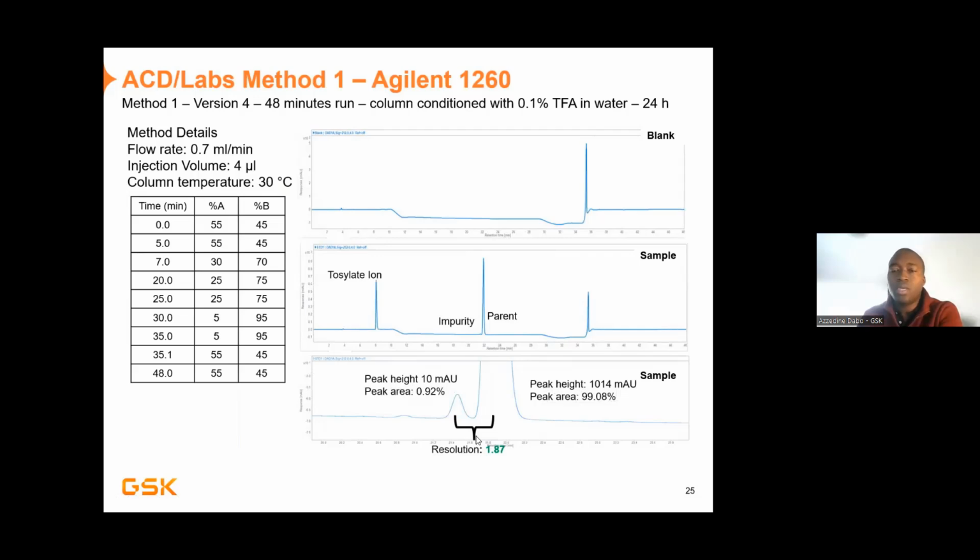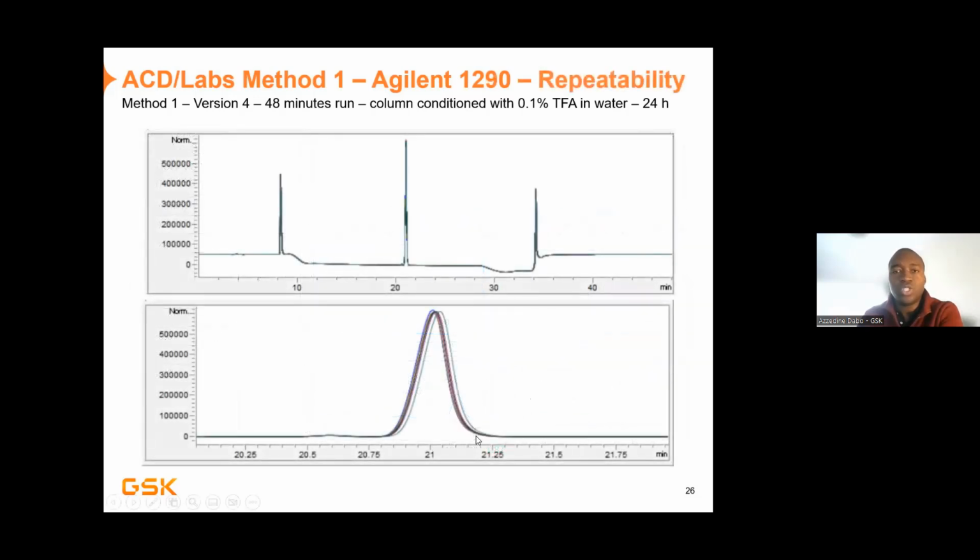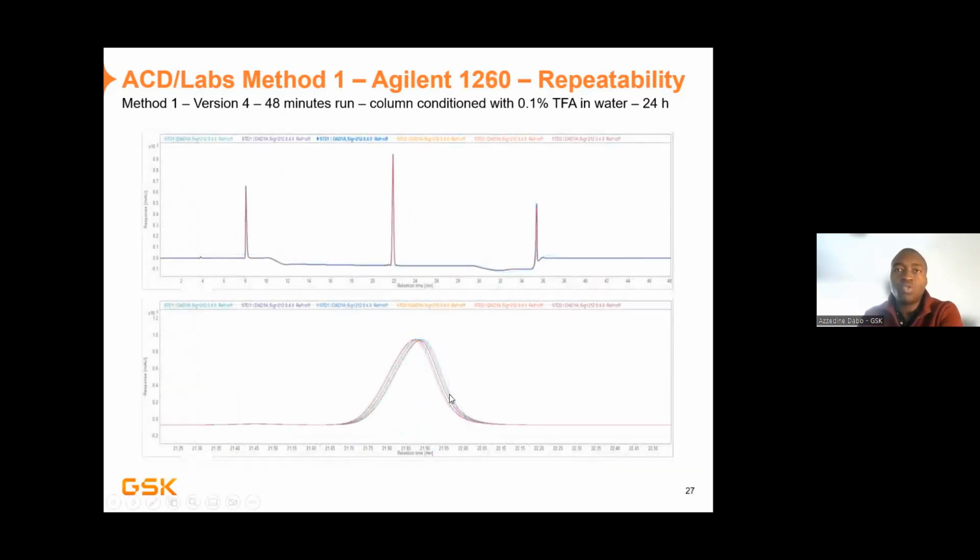Now, the other question we also wanted to check is, how about repeatability? As I've showed you in the past, a couple of slides ago, we could see those peaks were shifting over time. Now we can see there's a nice overlay across those peaks there. We also transferred that across to the 1260, the HPLC instrument, and what we can now see is a nice, perfect alignment across all those repeated injections.